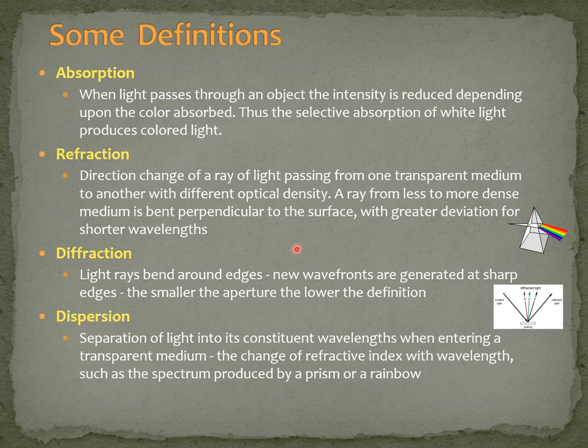This is just a summary of the characteristics I was using today of the light. There's more that we have no time to talk about, but just by using the absorption of light, refraction, diffraction, and dispersion, we can have some very good detailing on our samples. On the other hand, I also mentioned to you that there's a limit to what we can resolve, to what we can see just by using direct light in our sample. So I'm referring obviously to Abbe's law that I talked about a bit before.